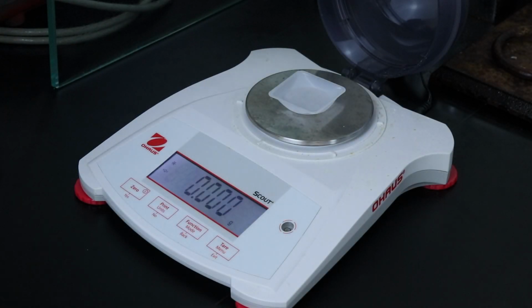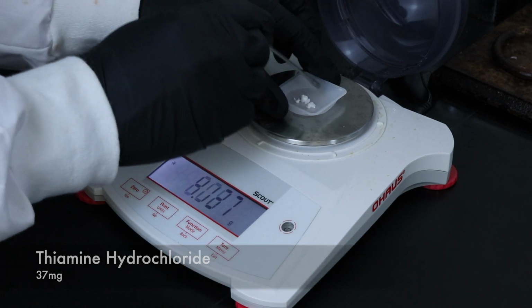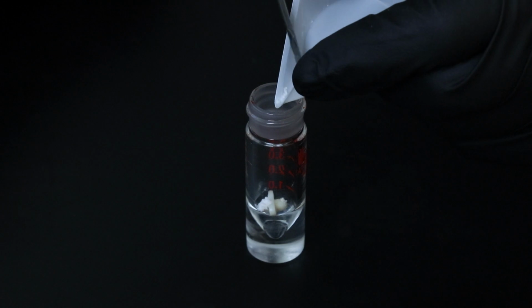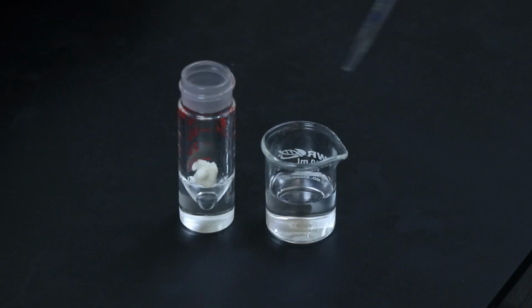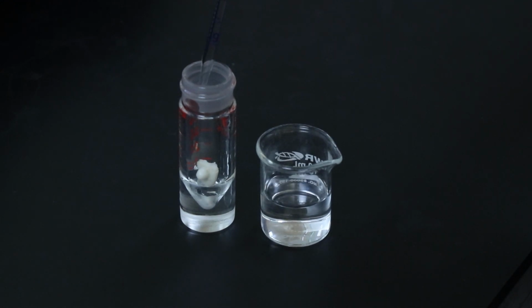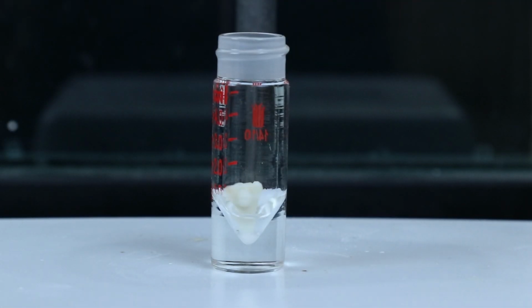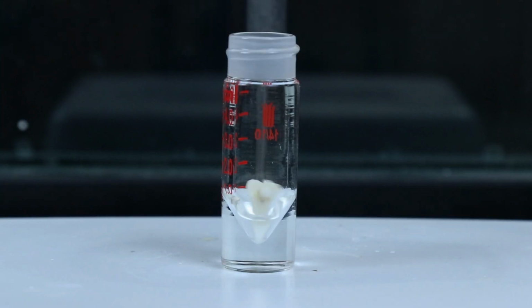Alright, I'm going to start by weighing out 37 milligrams of the thiamine hydrochloride salt and add that to a 5 milliliter conical vial with a spin vane. Then I'll add 110 microliters of water to start dissolving the thiamine hydrochloride, and I'll mix it with the spin vane until the salt is completely dissolved.